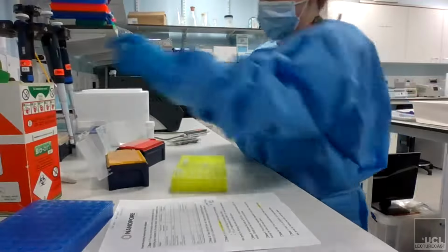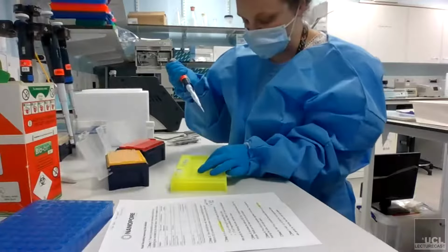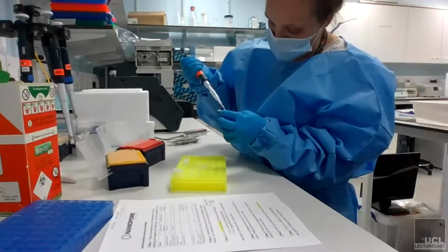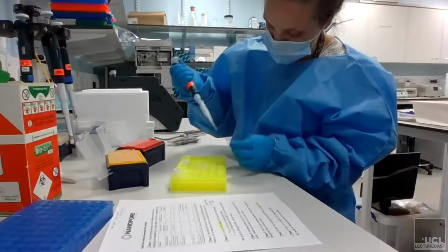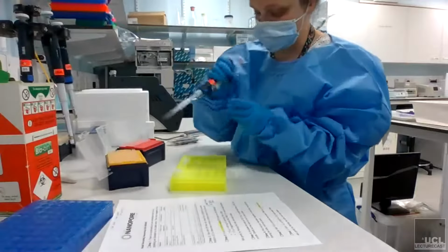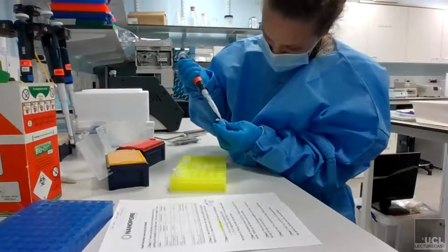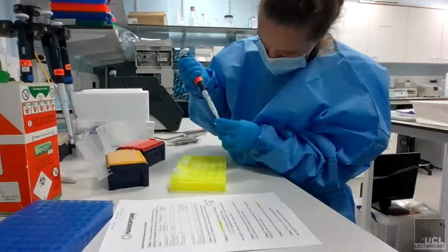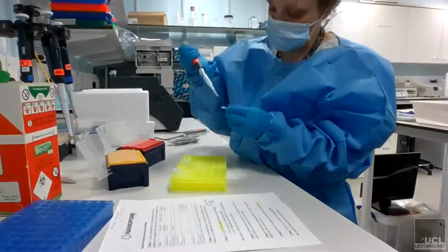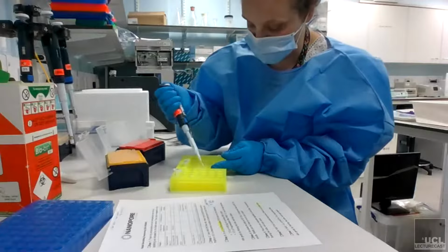You should have 10 microliters of sequencing mixture in each of the tubes. So overall, I'll have about 50 microliters because each will have 10. If you have 12 samples, you will have 120. Because of those barcodes, we can put them all together and it doesn't matter, because the computer will be able to tell them apart.